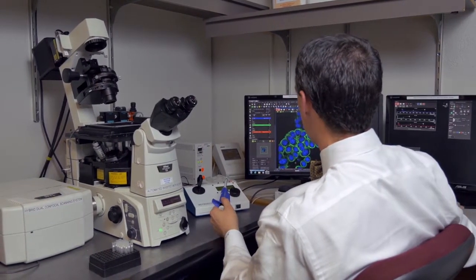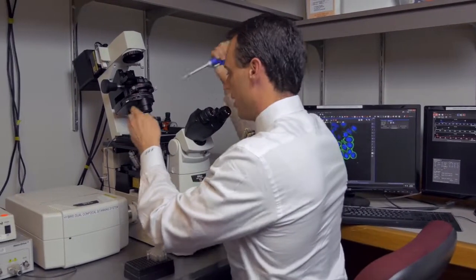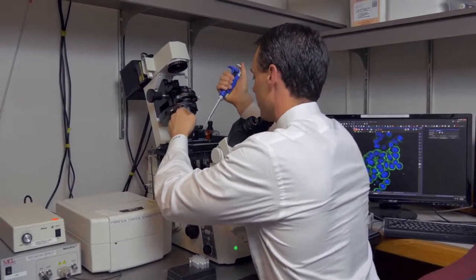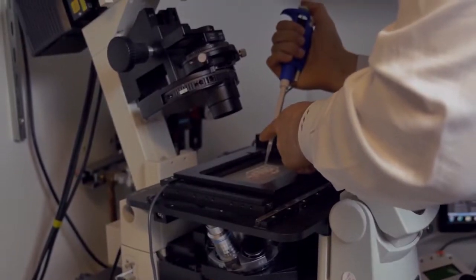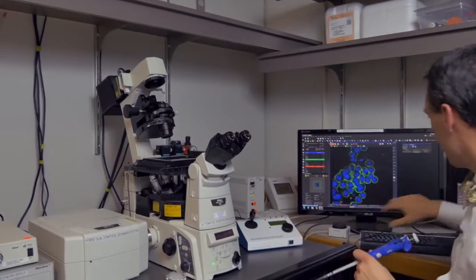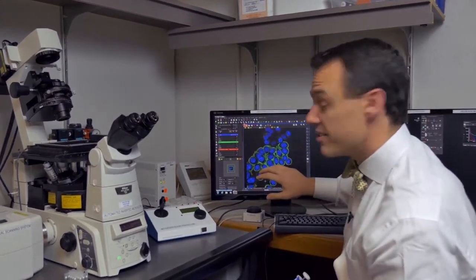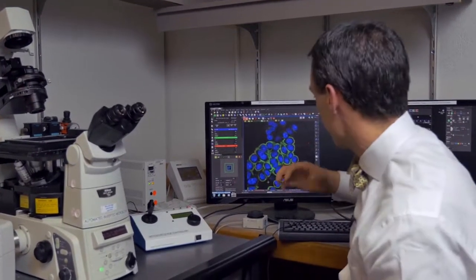So what I'll do is I'll go to all three channels, and I'll be adding these essential oils in real time. I just got a 100 microliter pipette here. I'm going to be adding a few microliters of this particular essential oil. Okay, so as you can see, we are now starting to see red coming as I added the essential oil to this culture. These are living human cells.